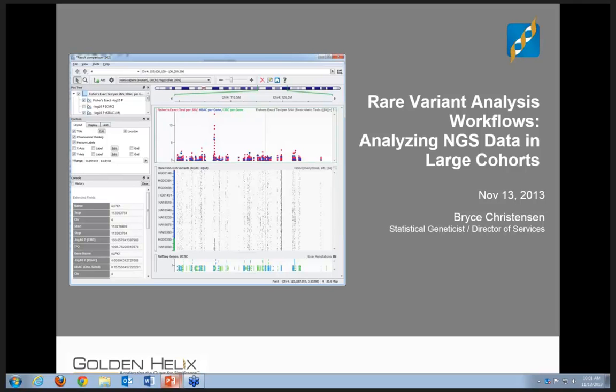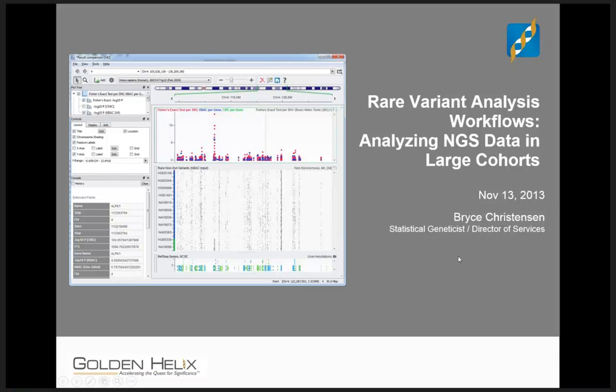Thank you for the introduction. I'd like to welcome everyone to our presentation today. Again, my name is Bryce Christensen, and we have a very interesting topic to talk about today. We're going to discuss rare variant analysis workflows, specifically when you're working in large data cohorts. Now, I realized as we were putting this together that there really is more to it than just rare variants. So I'll point out that we also will be talking a little bit about how common variants work into the equation in this type of data analysis.